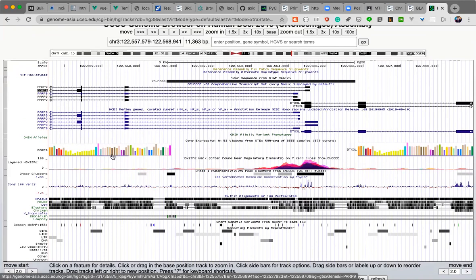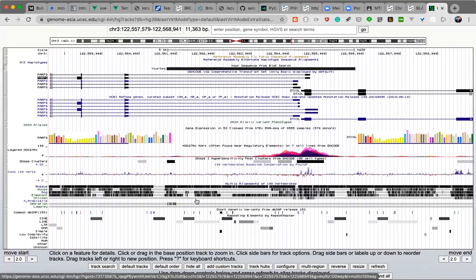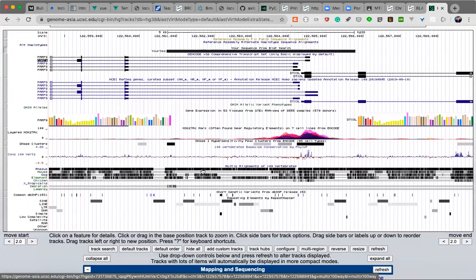They also have so many things on this Genome Browser, you can see many tracks. Each track represents something really useful, right? For example, you can see genes in other animals, so you can see whether the sequence is conserved in other animals by looking at the line.